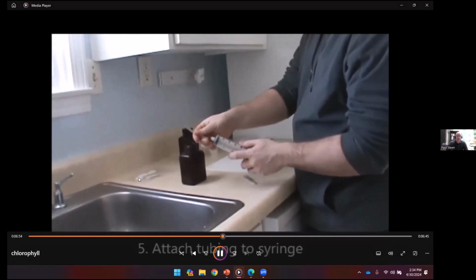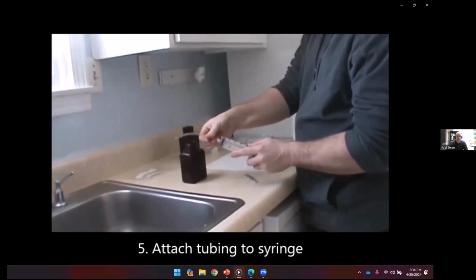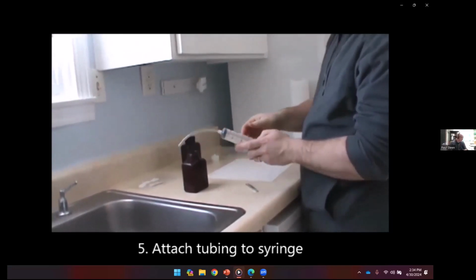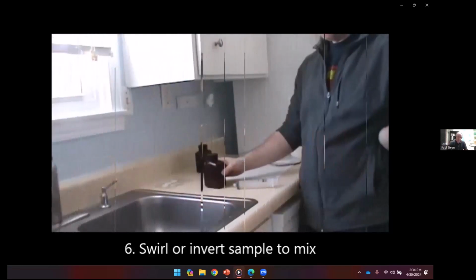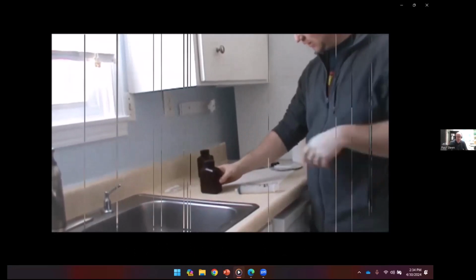Grab the syringe and the small piece of clear plastic tubing. You can push the tubing onto the syringe. It doesn't fit perfectly, but it will not slip off if you work at it. Swirl or invert one of the amber bottles to mix.